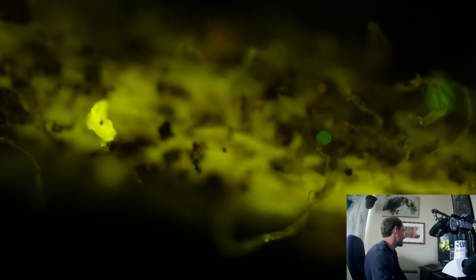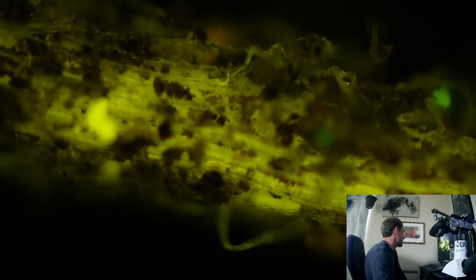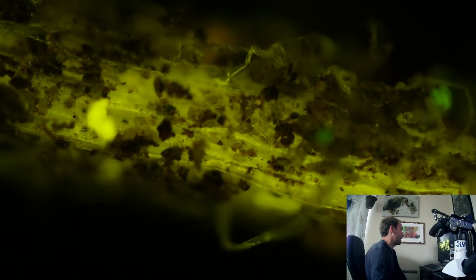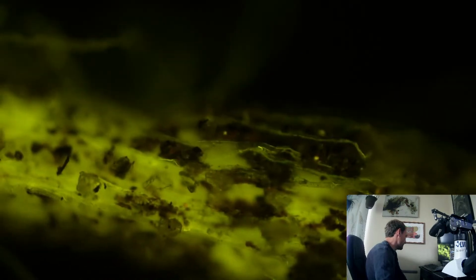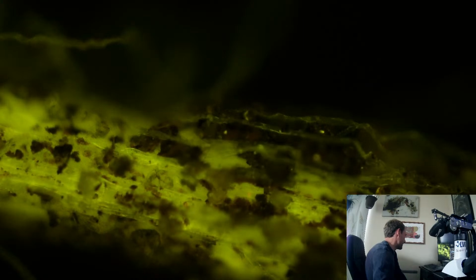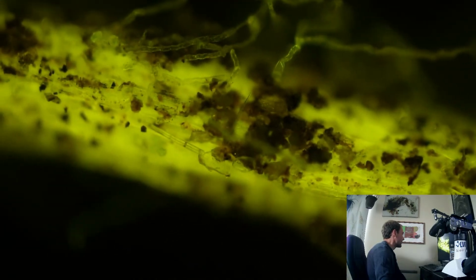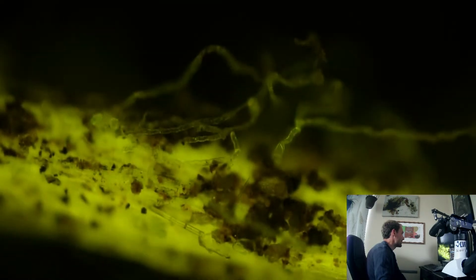Oh yeah, that looks like it's on top of the root. Something full of phosphorus, just sitting on top. Yeah, we got some more dark looking fungal hyphae. A lot of root hairs sticking off of this wheatgrass. Look at all those up there.